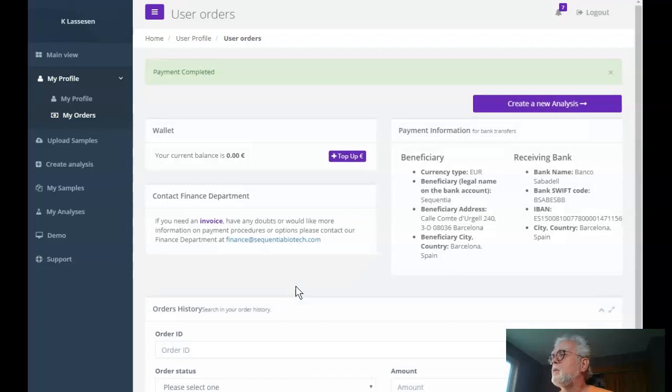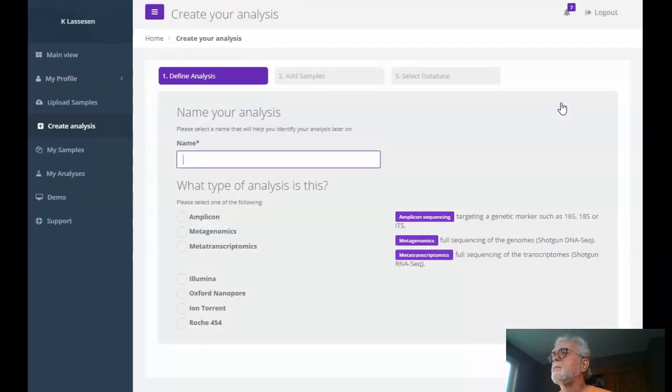And now we proceed to go ahead to create a new analysis. And what we now do is give a name for it. I'll call this one a walkthrough. And we select this one, and notice the reason is the data is existing as data. The other two are different types of data analysis for DNA. They don't apply, so we need to make sure we select that one.